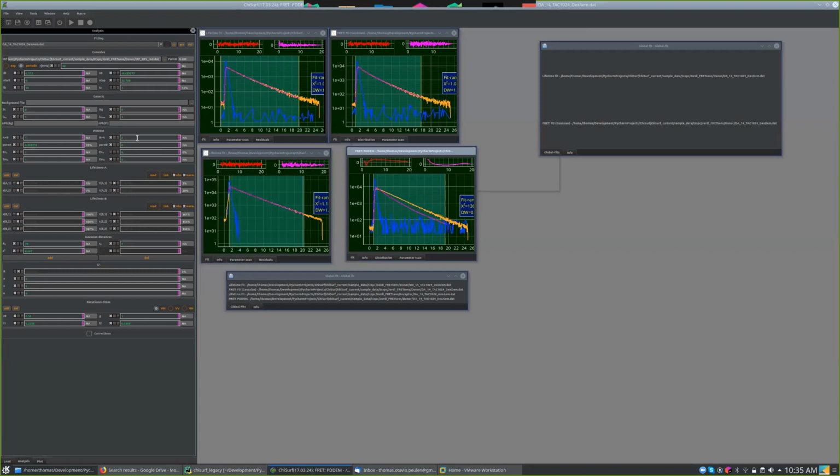Okay. So PUA could be any scalar, right? Even high numbers? Yeah, it could be any scalar. Internally, it's just multiplied with that number. But I would recommend you to use normalized values, so 0 and 1. Okay, and the same for the rest.